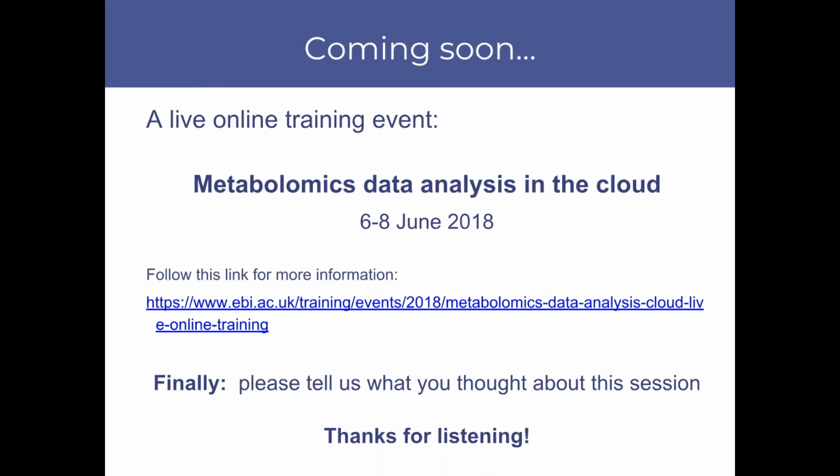Okay, so I see a few questions. Somebody wished for a practical metabolomics example. I'm sorry, I don't have a practical example ready. However, there's a number of tutorials that you can access through the PhenoMeNal website, which will take you through the workflows, and you can follow step by step and see how you'd run a practical analysis session with one of those workflows, for instance.